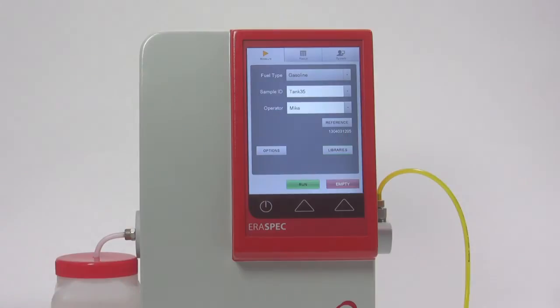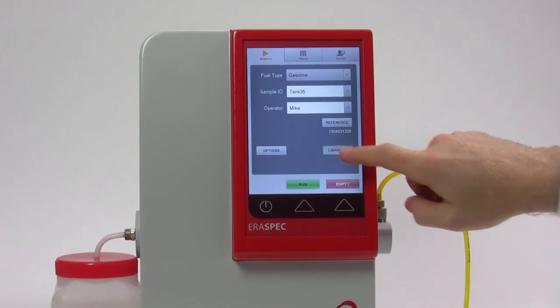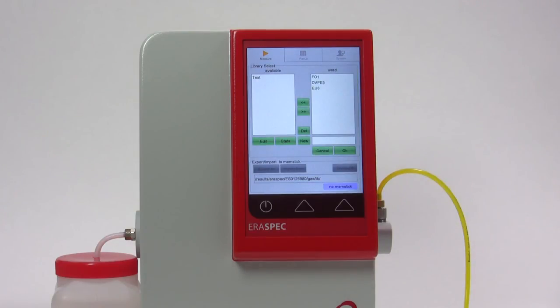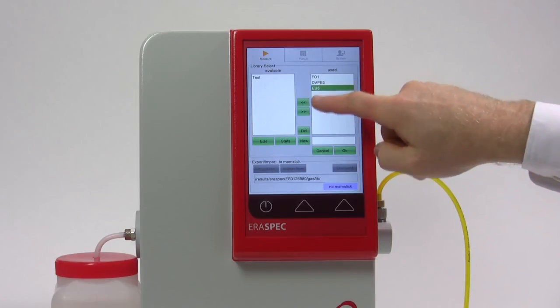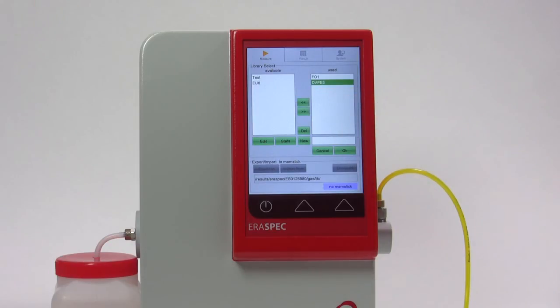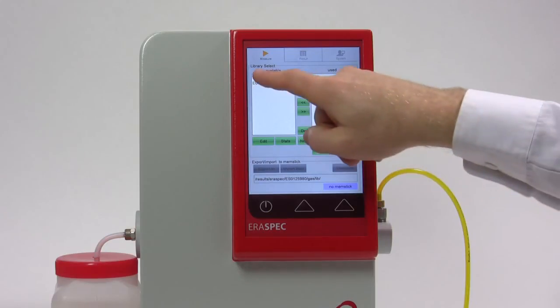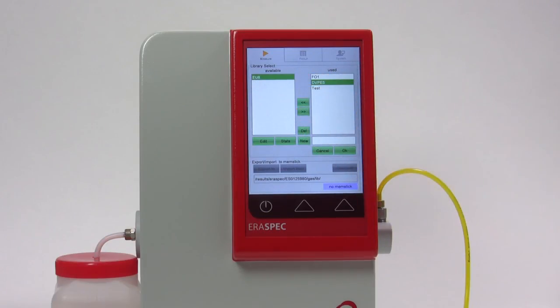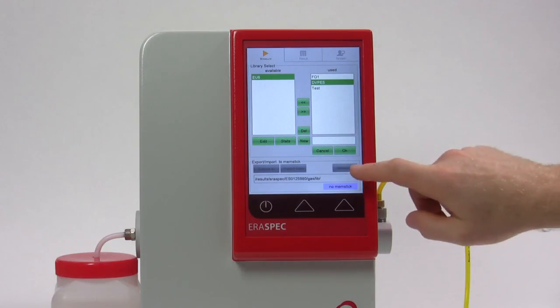The libraries can be found in the Measure menu under the Select Libraries option. The box on the right, called Used, lists the libraries used for a measurement. All other available libraries are shown in the box on the left, called Available. Use the left and right arrow keys to activate or deactivate a library by moving it to the Used or the Available box.